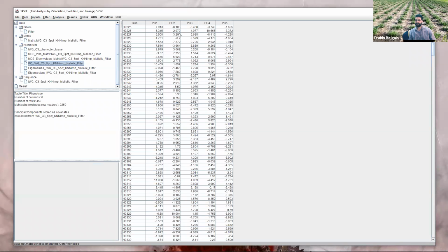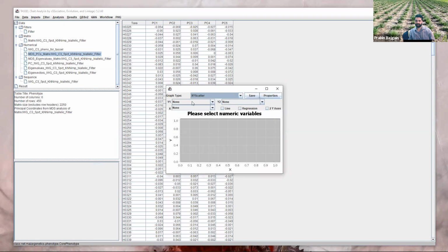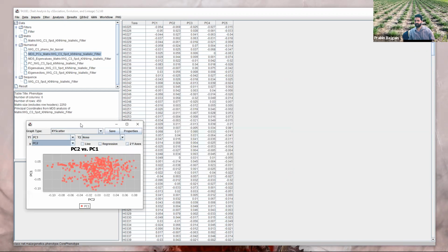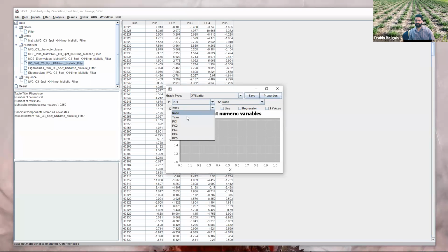All right, so we have some values here. I don't know if we can compare side by side. Probably not. Let's just look at the scatter plots because you will see that they will look different. So for the MDS, we're going to do PC1 versus 2. This time we have PC2 on the x-axis. Select the same for the PCA. Scatter 1 on Y and X.